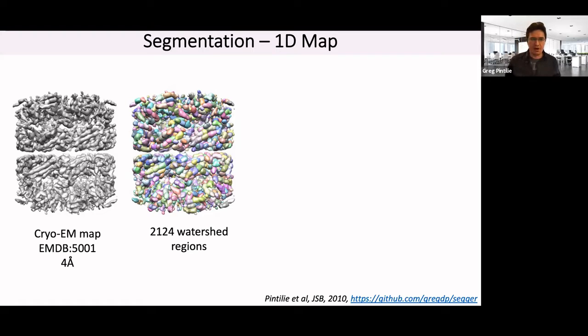You can see that there are a lot of little blobs, and each blob, much like in the one-dimensional case, you can think of as corresponding to a peak, and the boundaries between two blobs fall at the lowest point between those two peaks. If you look closely, some of the blobs might be attached to each other.